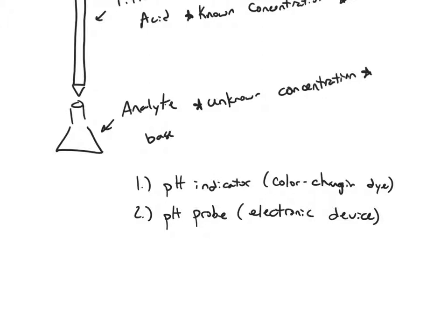Now we will actually use pH probes in our labs because that's what we have available to us, and they are ideal. pH indicators are tough. Sometimes the color change is subtle, like you go from a blue to a green, and it's very hard to know when you've hit that pH threshold exactly. Phenolphthalein is one of the only ones that changes so starkly. The contrast is so stark. pH probes give you a drop by drop analysis of the pH along the process of a titration.